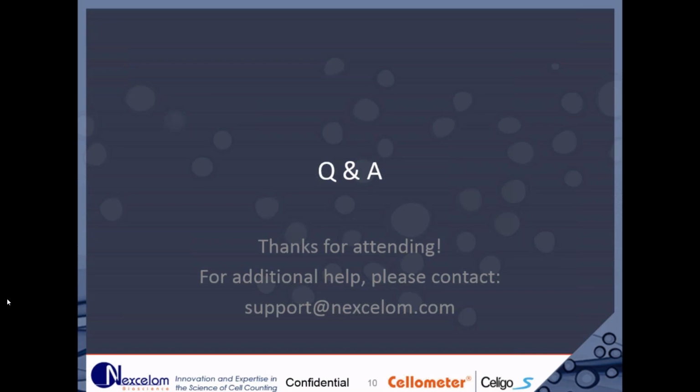Next question. If you were to plot the mean intensity instead of the integrated intensity, would the plot look different? So in the webinar video, I did showcase that you could see in the CSV file the mean intensity. There was a titration out at the top end of the Jurkat positive stained antibody, and it did form a curve.